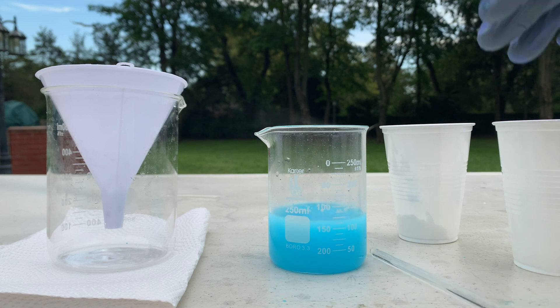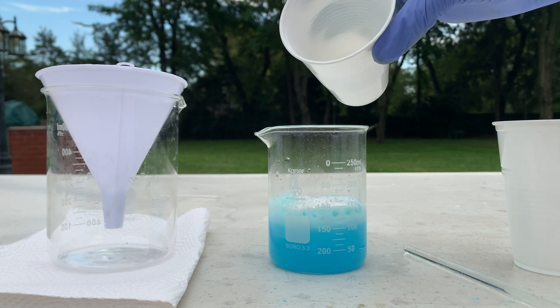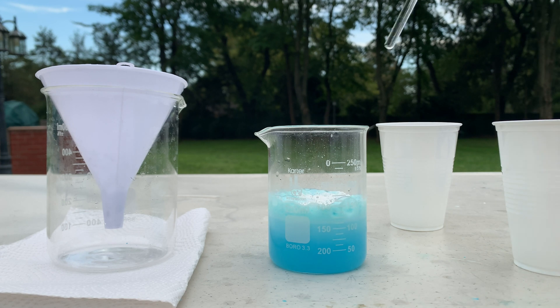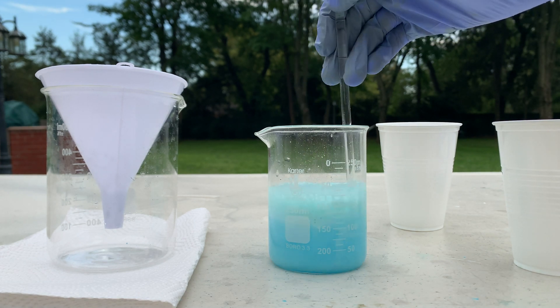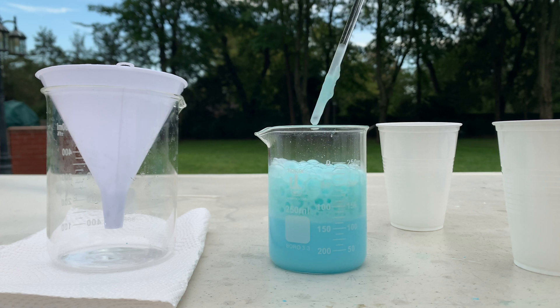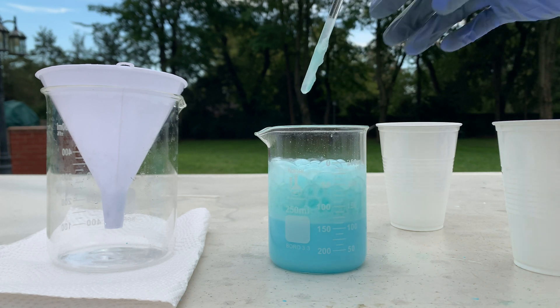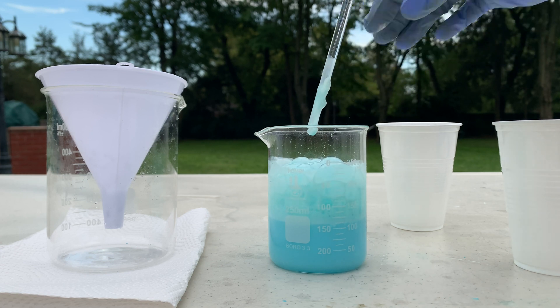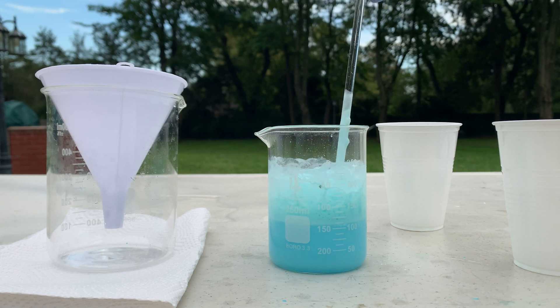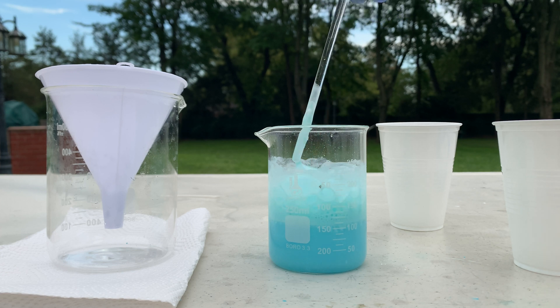I'm going to add the last bit of sodium bicarbonate and mix it around a bit. Hopefully this doesn't over spill. Yeah, we're getting a decent amount of foaming. I could have added it a bit slower to prevent this, but it's fine since it didn't over spill.